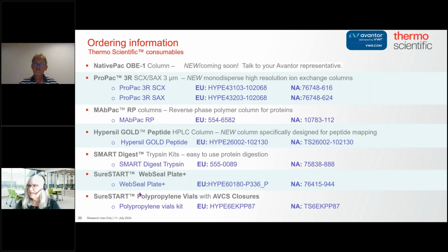Okay. One additional question. I could not really catch the name or which country he is coming from. Do you see method-induced oxidation when digesting at the lower pH? No, the oxidation tends to be okay. You're in an environment where you've got a lot of TCEP there as well, and it just keeps oxidation down. We don't tend to see any added oxidation, and we don't tend to see the deamidation effects as well. So I'd say that's a good benefit.